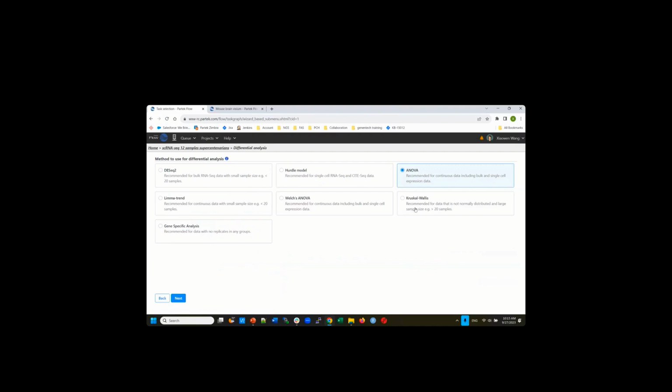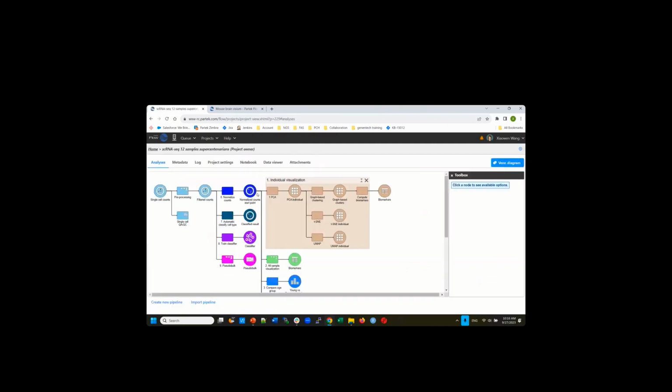But some other algorithms, like non-parametric analysis, won't. You can only add one factor. So in other words, some statistical methods can take care of the batch removal. So you can use batch removal only for visualization.